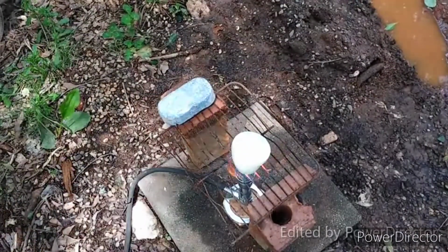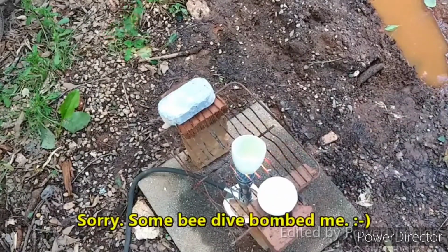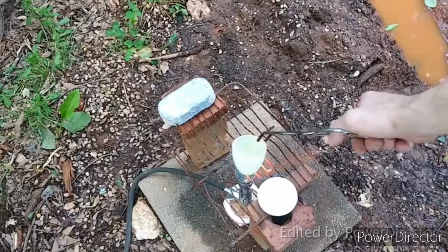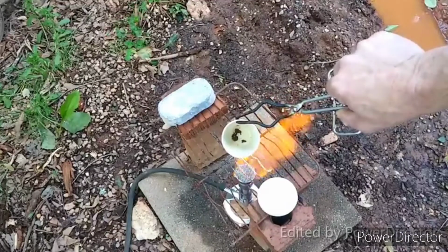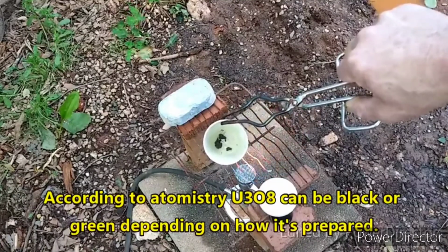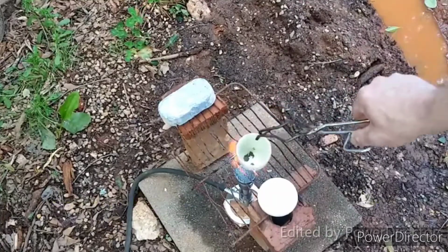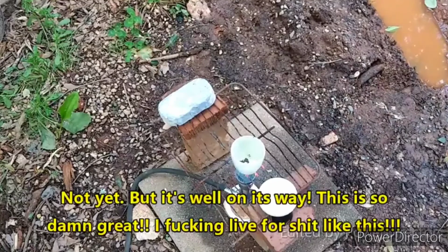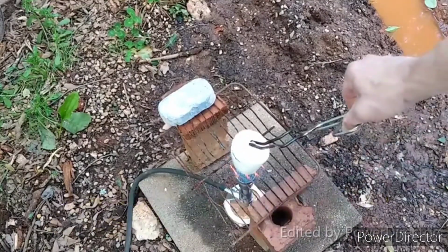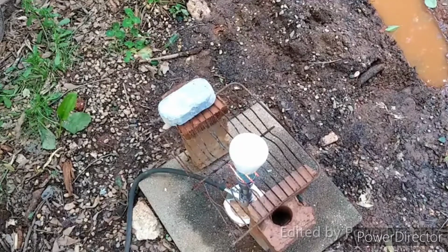All right, everyone, time to check on our Urano-Uranic Oxide and see how it's doing. Don't you tip over. Okay. Looking good. Definitely looks different than the other stuff, and my God, it even has a slightly greenish tinge. I do believe this is working, people. Ha! It might even be done already. I'm going to put it on here for just a little while longer. We'll let it sit on here for another 15 minutes or so. Maybe, I don't know. No, we're going to let it go for another 30, just like the uranium trioxide, and then we will come back and check on it again. Oh, this is so great. It looks like it's actually happening.